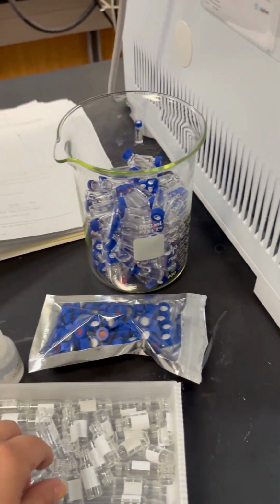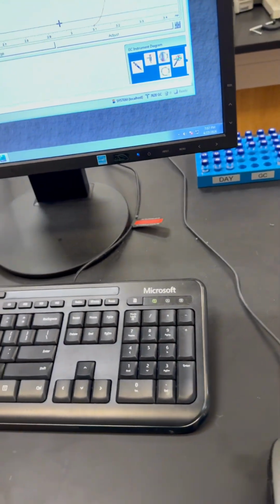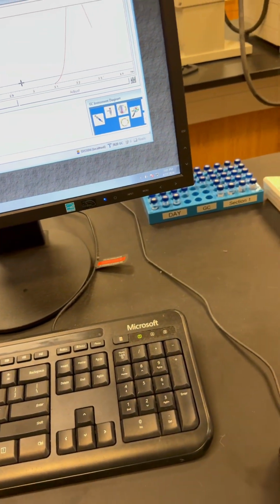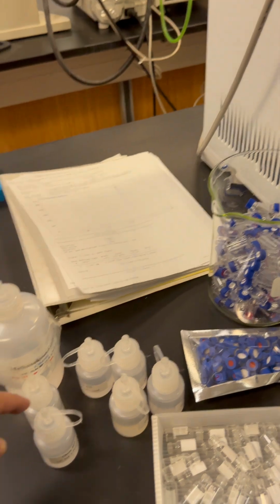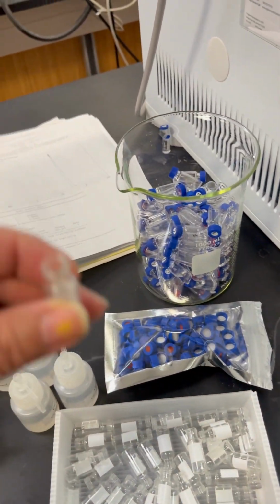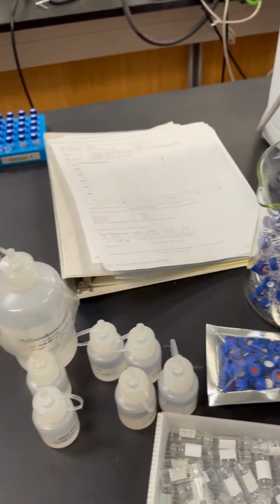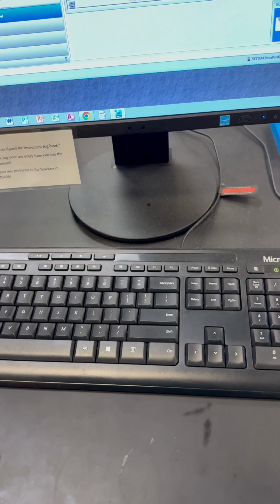You're going to put each of them in here, and you're going to put the lid on, and also a mixture of the 3 standards. So you're going to add these 3 standards in one of these and mix them very well, and put the lid on and mix very well and put it. So it's going to be 9 samples. That would be your second run.